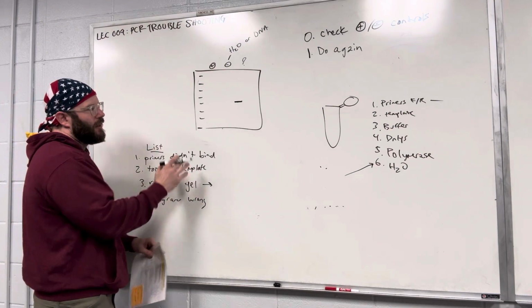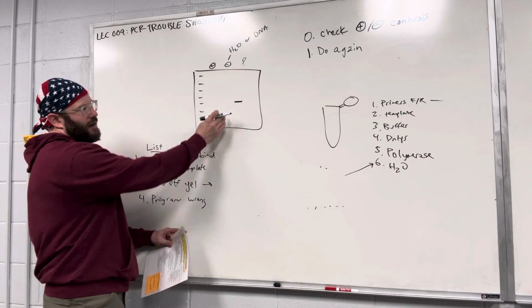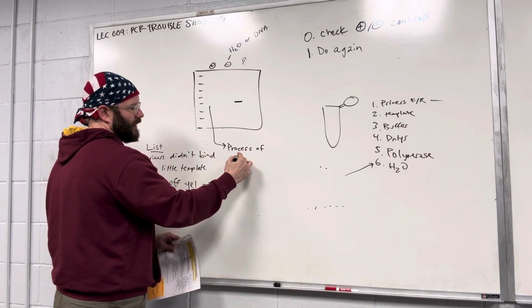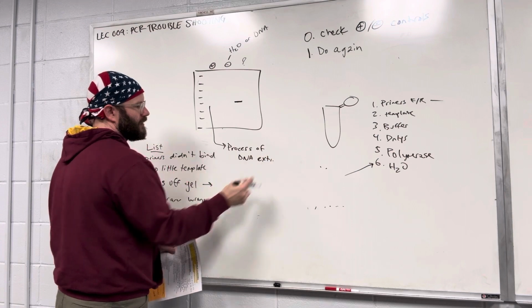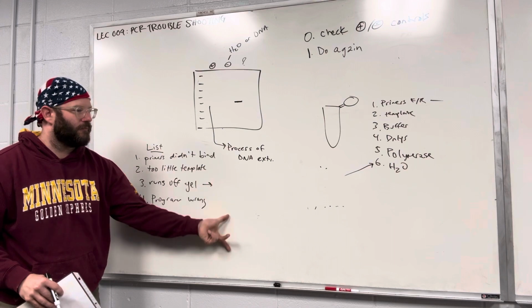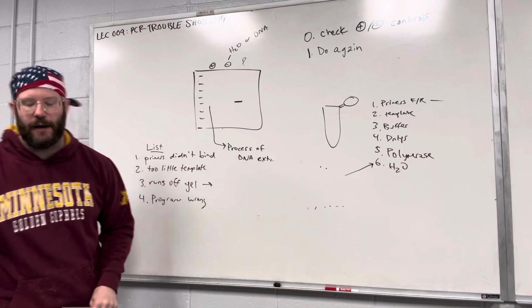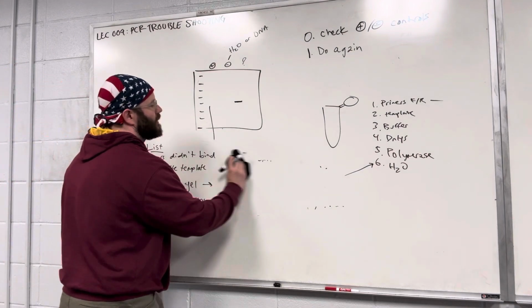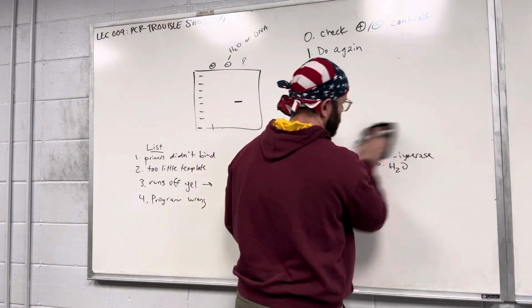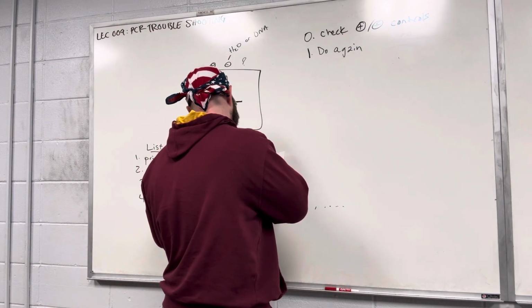But oftentimes, before you do any PCRs, there's a genomic extraction where you're extracting DNA. So if you ever have a result like this, probably your process of DNA extraction is bad. If it's not that, then maybe it's downstream PCR things. But if your positive control is missing, then perhaps your process of extraction is bad. Okay, so let's further elaborate on this list of things you should do. Let's see.